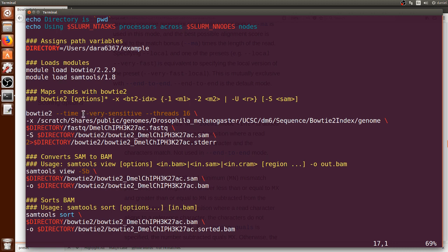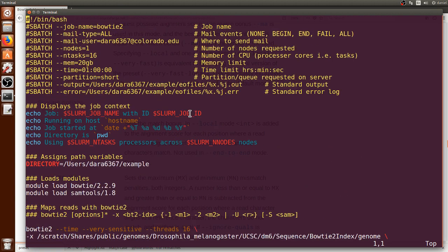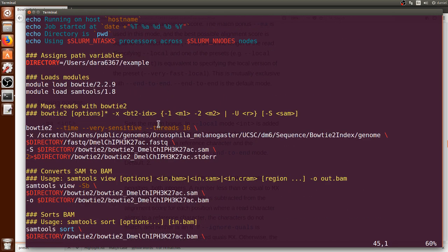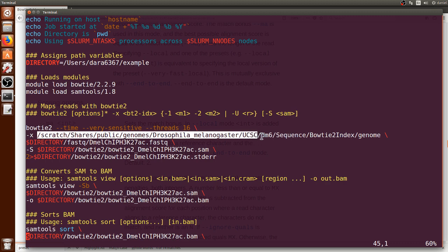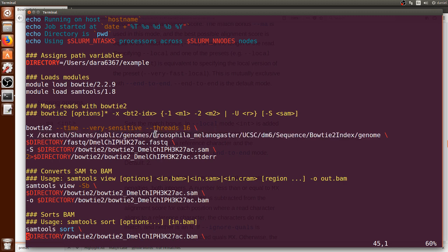We can go back to the terminal so preset conditions very sensitive and again we specify the number of threads or processors to be 16, which should match what you specified earlier as number of processors. We put dash x and it should contain the specific path on the computer cluster that you're using that leads to the reference genome that you want your reads to align to. In this case I am using Drosophila data.